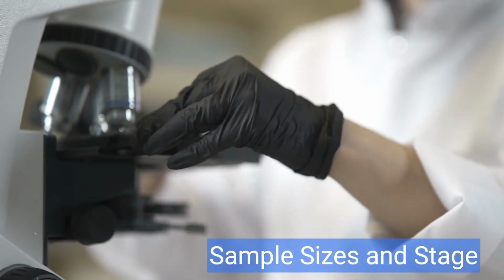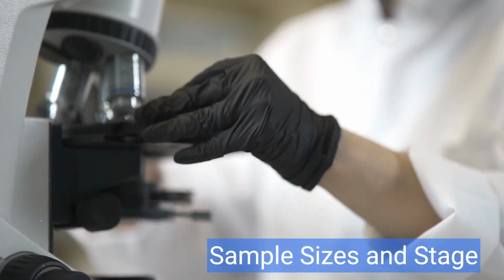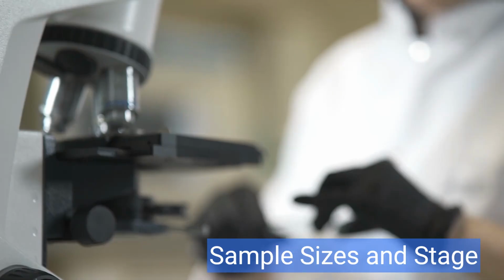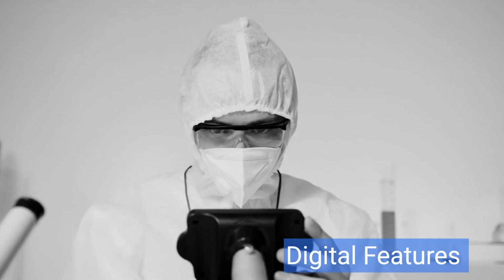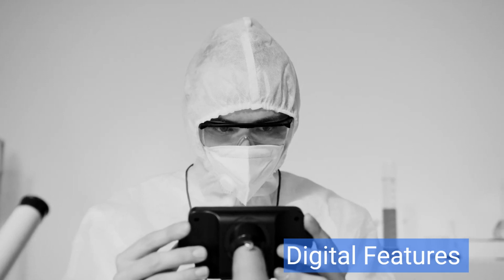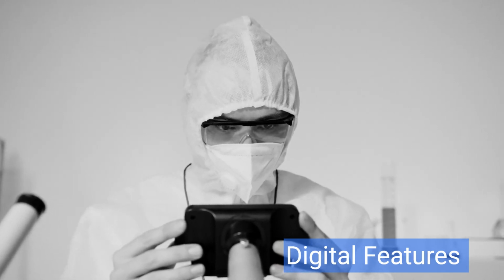Step 6. Sample size and stage. Consider the size of the specimens you'll be observing. Some microscopes have larger stages for accommodating larger samples. Step 7. Digital features. If you need to capture images or videos, consider a digital microscope with built-in cameras or the ability to connect to external devices.